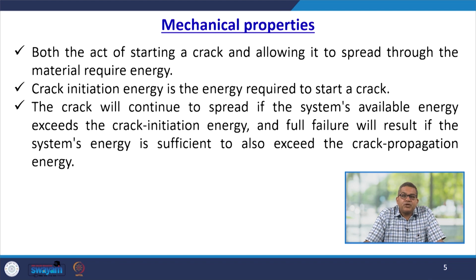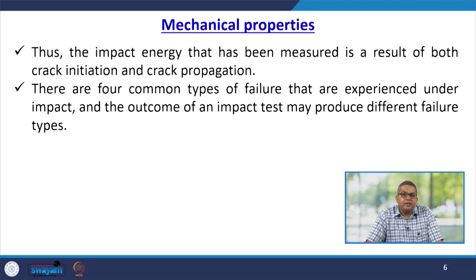Now, crack initiation energy is the energy required to start a particular crack, and the crack will continue to spread if the system's available energy exceeds the crack initiation energy, and full failure will result if the system's energy is sufficient to also exceed the crack propagation energy. Thus, the impact energy that has been measured is a result of both crack initiation and crack propagation.